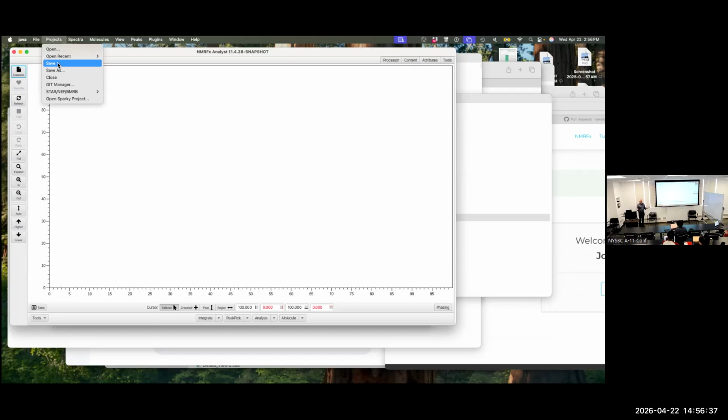A project is just a folder on your disk, and it has 5 subfolders. I'm going to try to simplify it. The data sets: any data set you open in the project ends up getting what's called a hard link from that folder. So that folder looks like it has the data set in it, but it's not duplicating the original. And if you delete the original data set, it is actually still in your folder. So it saves space, but lets you get rid of the original stuff.